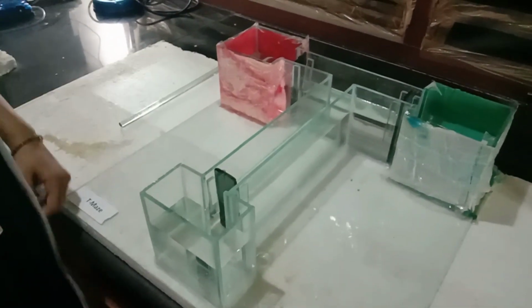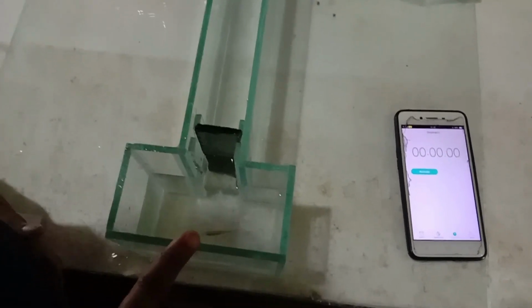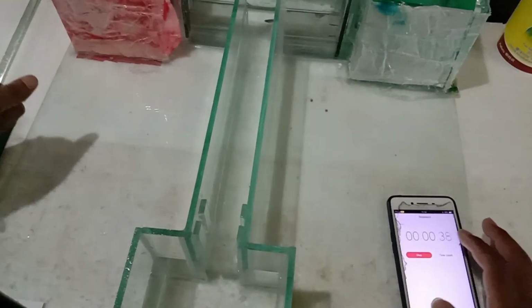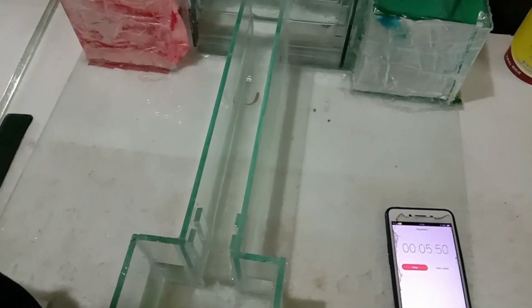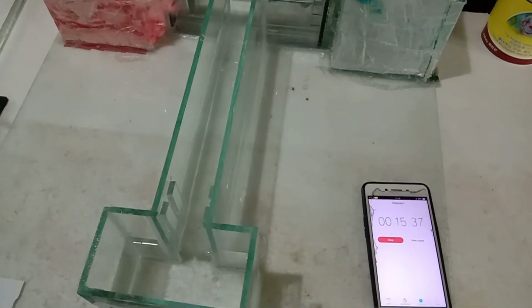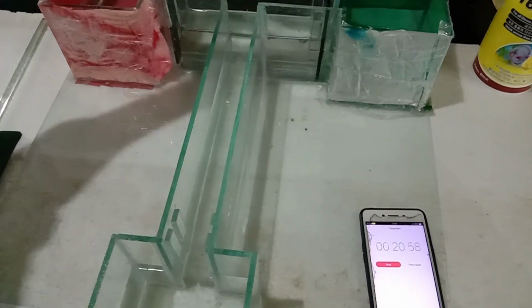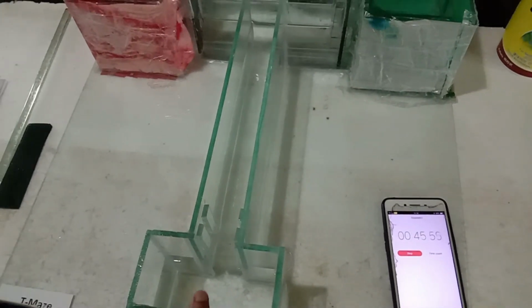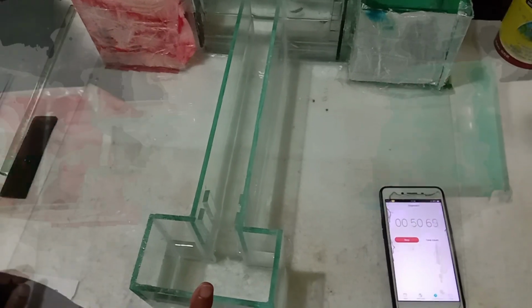So let's start with the experimentation part. Initially, we place the zebrafish in the starting zone and we open this gate leading to the long arm along with the timer set for 5 minutes. So we allow the zebrafish to explore this long arm and the starting zone for 5 minutes. The gates leading to the unfavorable zone and the favorable zone are closed. This 5-minute period is divided into 2 parts. One is habituation time, for 3 minutes, and 2 minutes are given for recording.